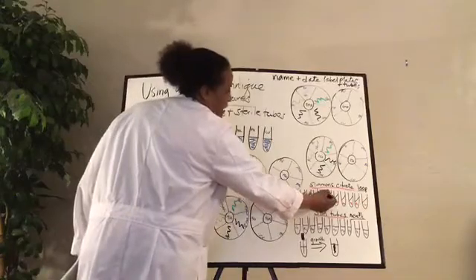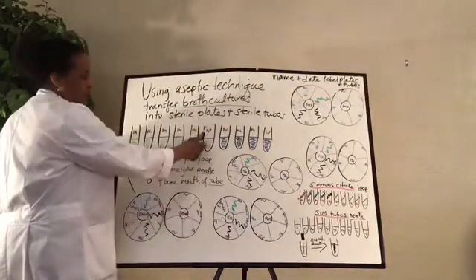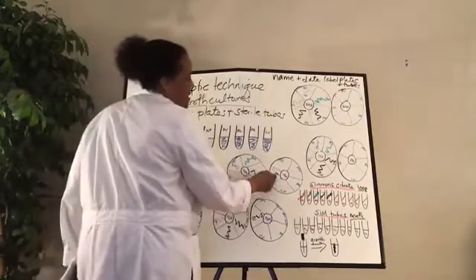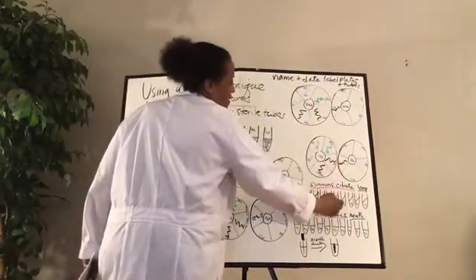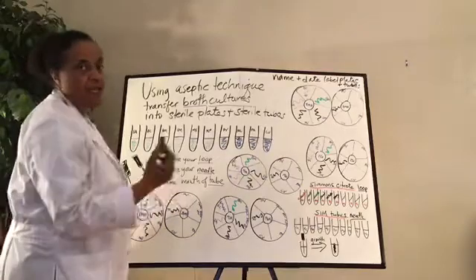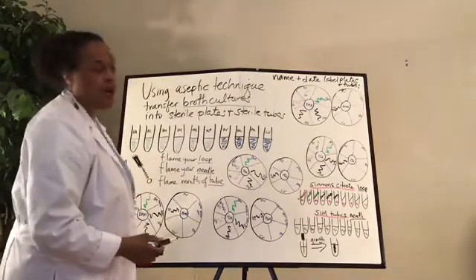And just say that one, okay? Now we're at the next one, and flame everything. Do your KP on all of them. I think you get the gist of this. Then you might as well. But each time, make sure you're flaming the loop and flaming the mouth, flaming the loop, flaming the mouth, and go in and get it. Let the loop cool, and then inoculate the agar.